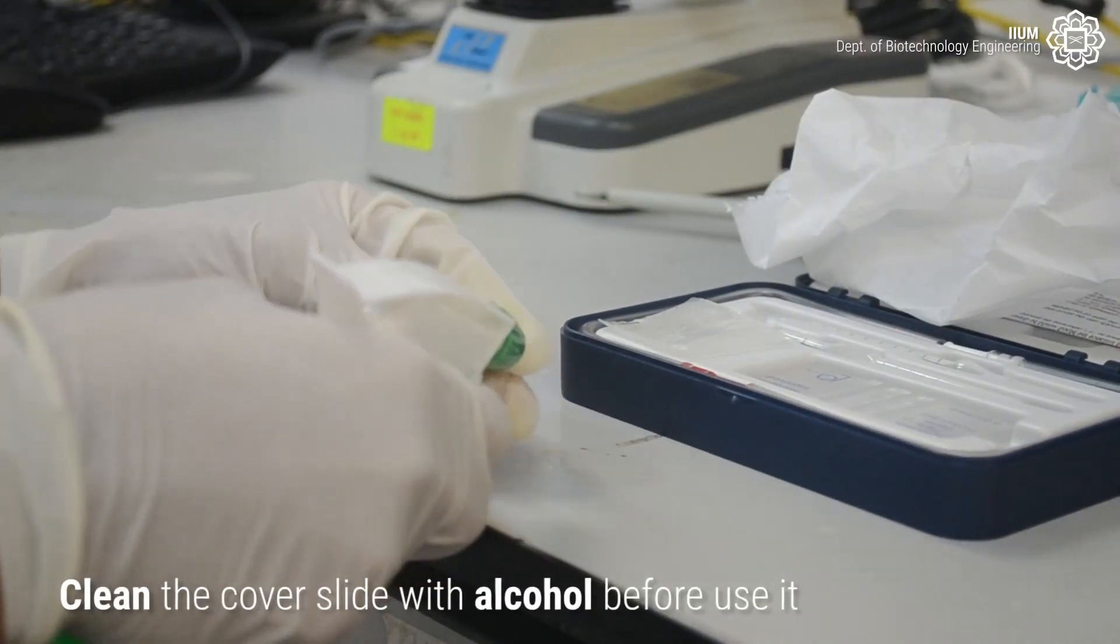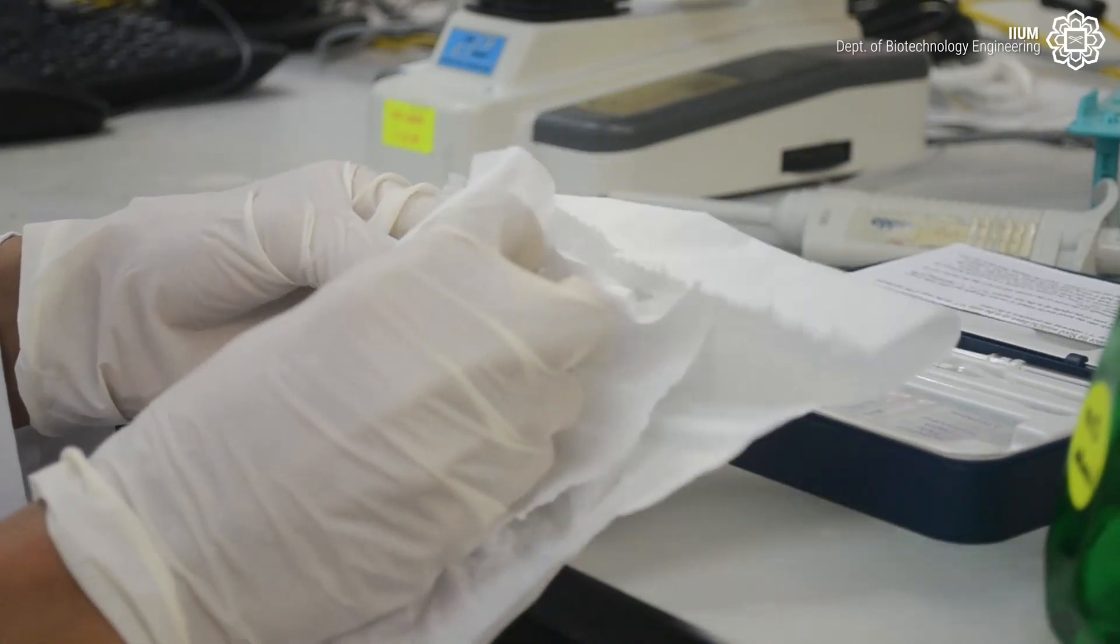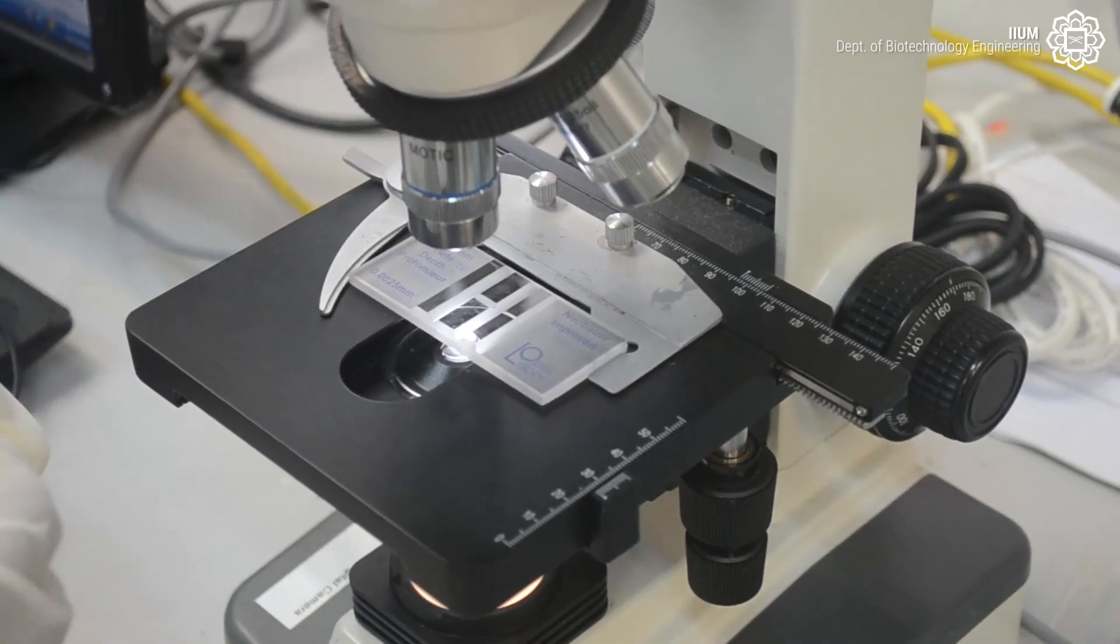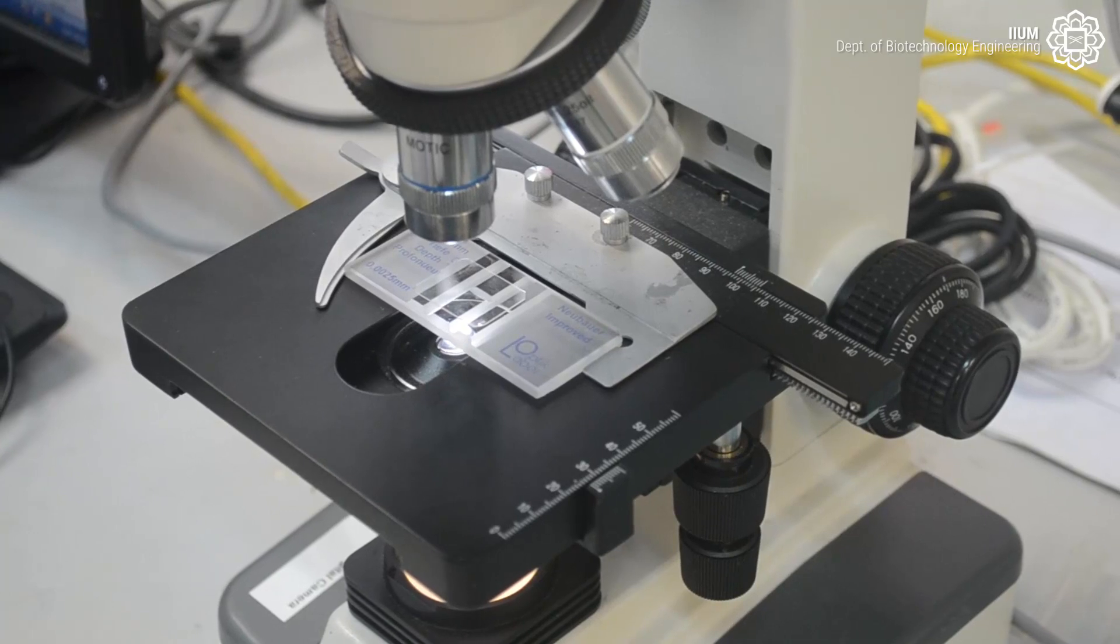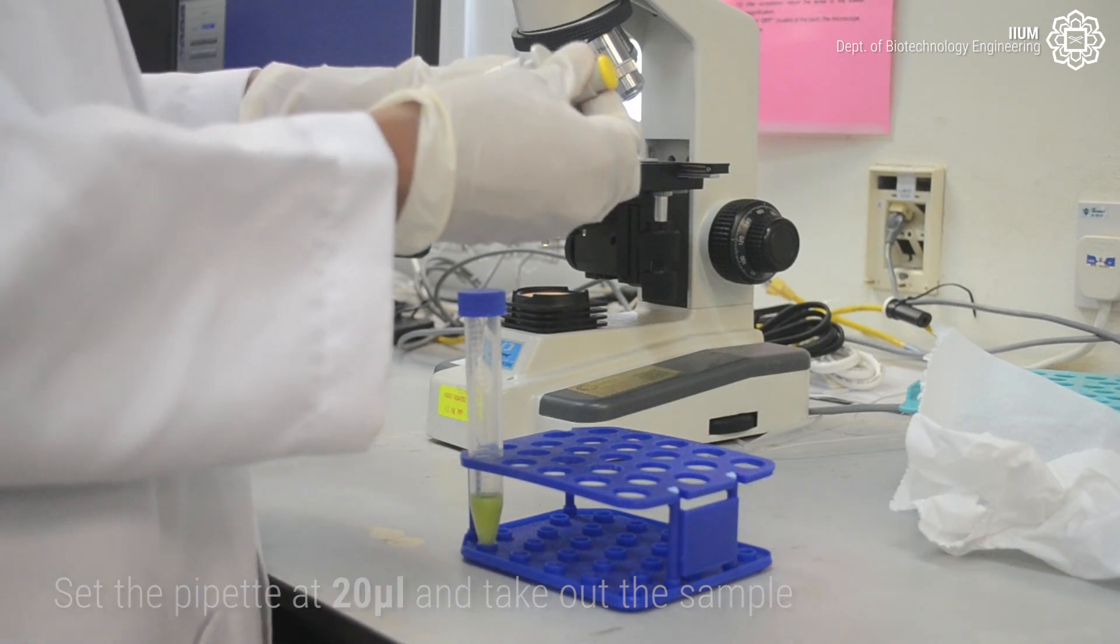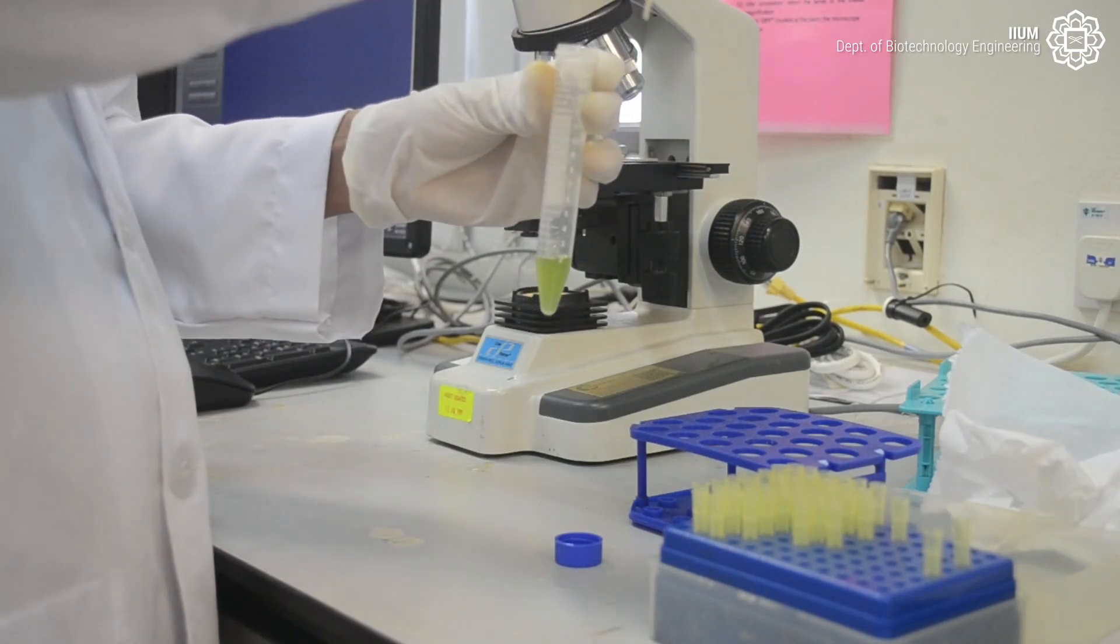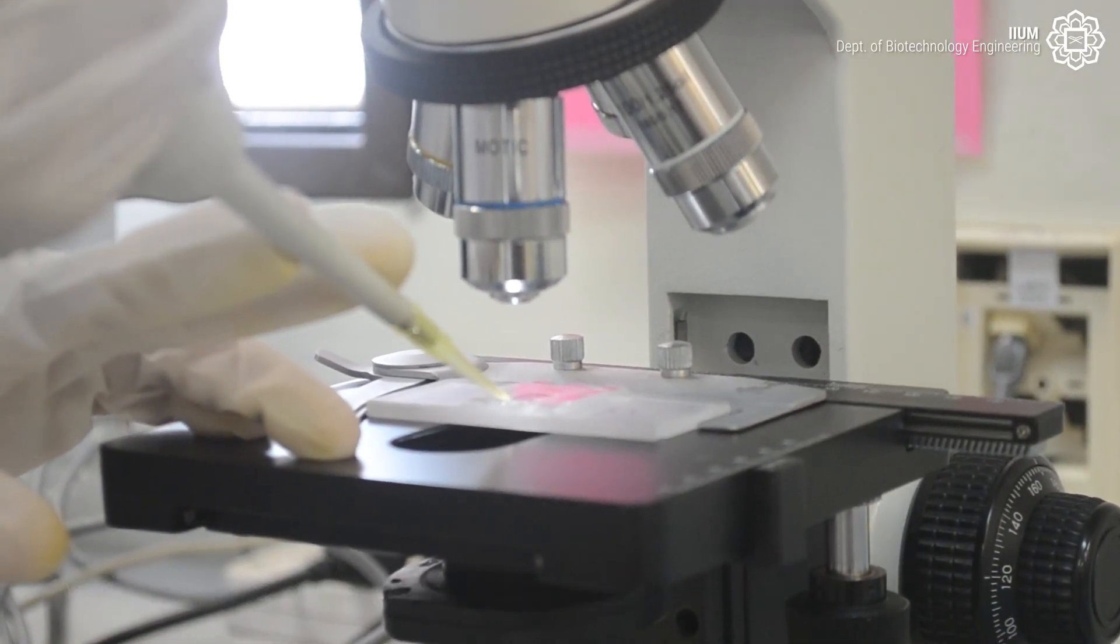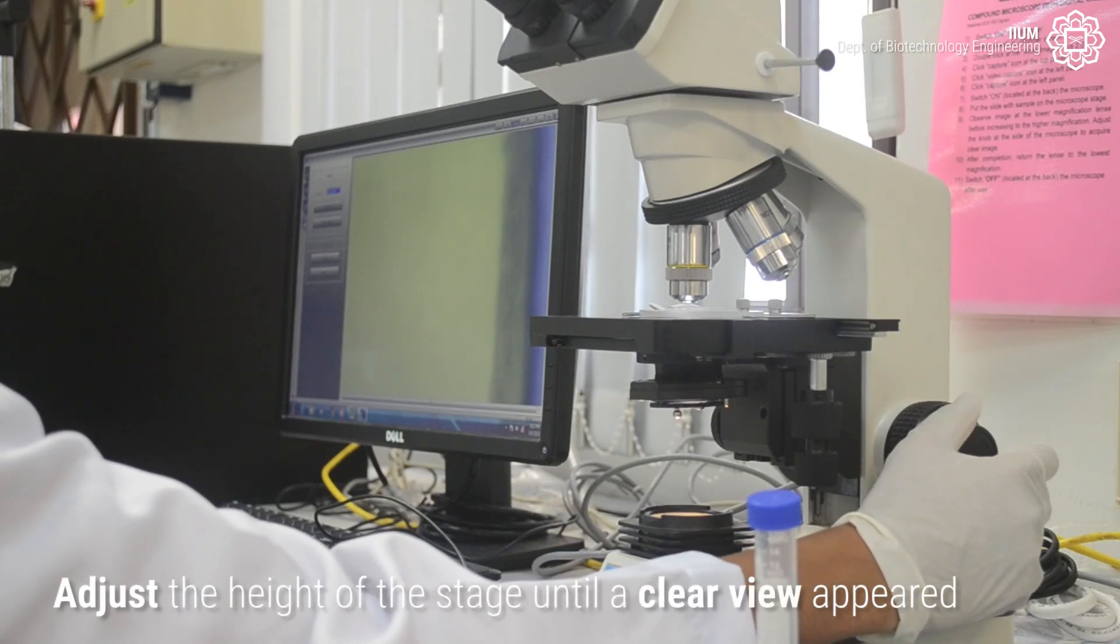Clean the cover slider with alcohol before using it. Put the hemocytometer and cover slide on the stage. Set the pipette at 20 µL and take out the sample. And put the sample on the hemocytometer. Adjust the height of the stage until a clear view appeared.